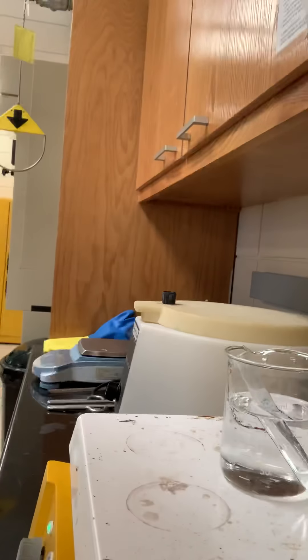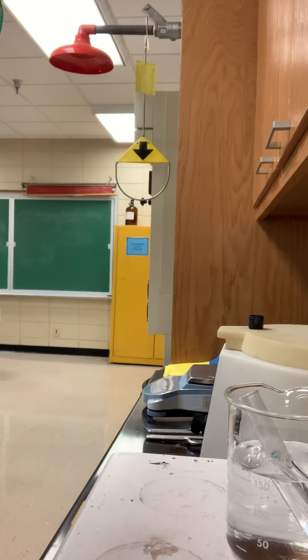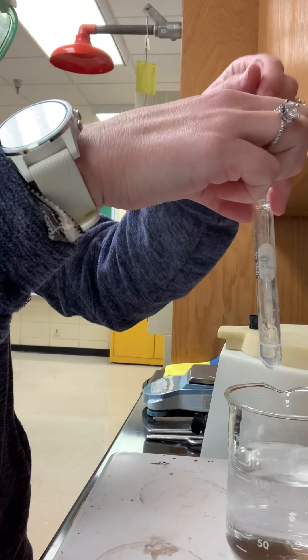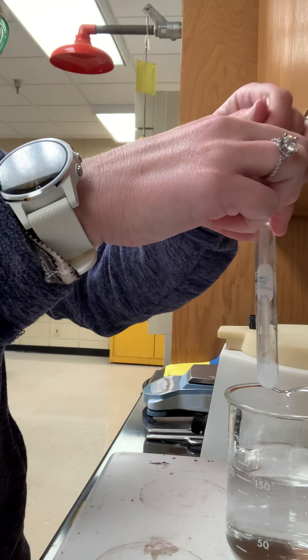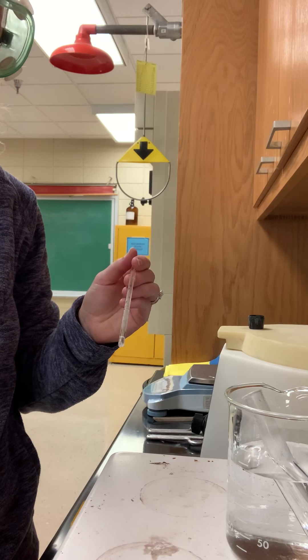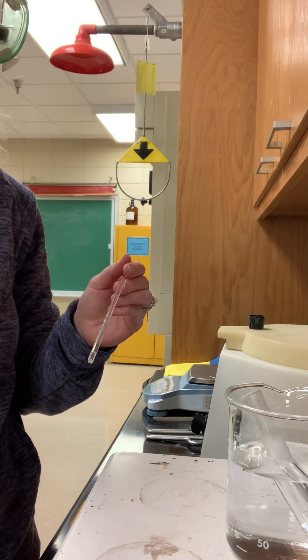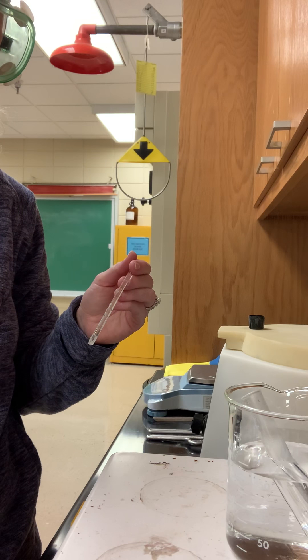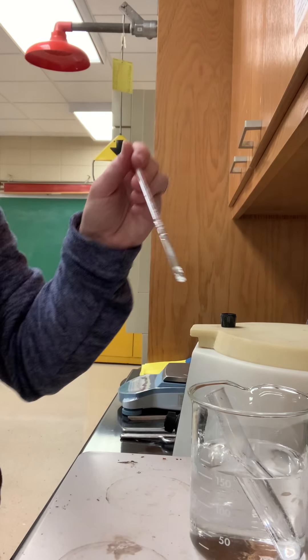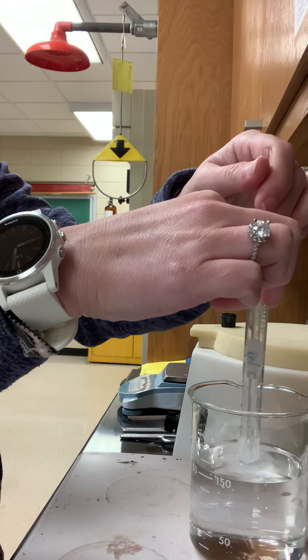Here we are over at the hot water bath. Here's my test tube and I'm going to stir it again — wait a few more seconds, then we'll do it again. We need to make sure that we leave it in here for the full length of time. The solution is starting to boil and it's making the test tube jump.